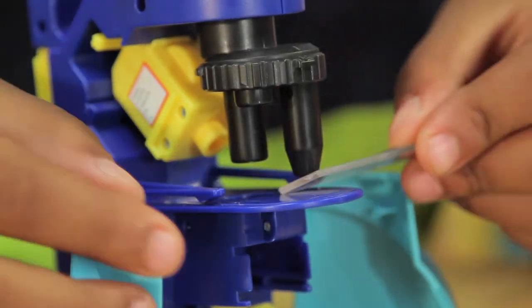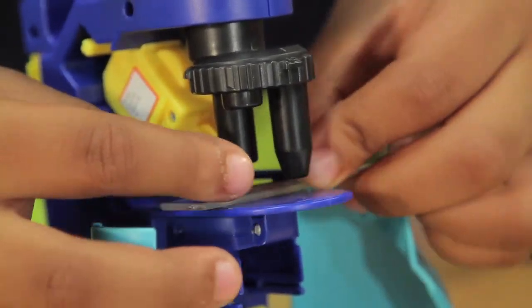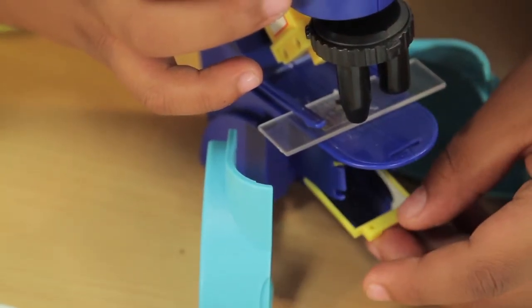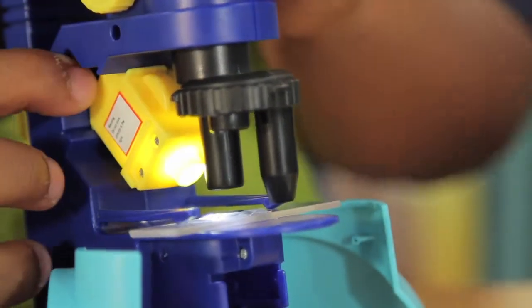Mount the slide by inserting it into the stage. Adjust the reflecting mirror for best lighting of the object. If it seems too dark, turn on the light.